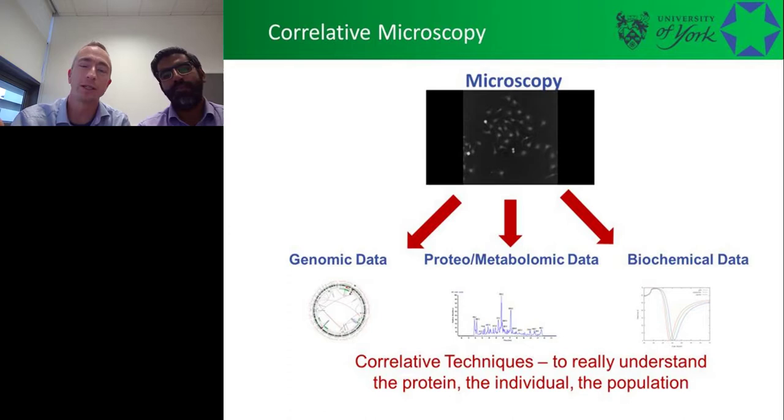different and behave differently. So I want to now link microscopy. This is where it's all going. Single cell imaging to single cell transcriptomics, single cell metabolomics, and further. Not only that, something we're getting here at York in the coming months, something called a NanoString digital spatial profiling system, DSP, which enables us to do really high multiplex work.